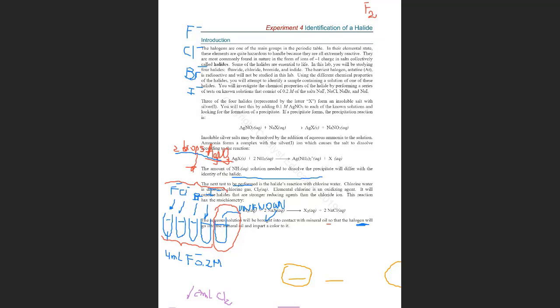You have the chlorine water, and it reacts with the halides. And it is a redox reaction. So let's understand what is going to happen.